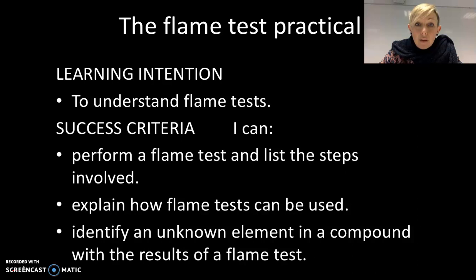So the whole objective of this unit is for you to develop some skills and techniques that enable you to identify unknown compounds. And we'll be doing that finally next week, and you'll need to complete your booklet. But the flame test is the last skill that you'll need to develop.